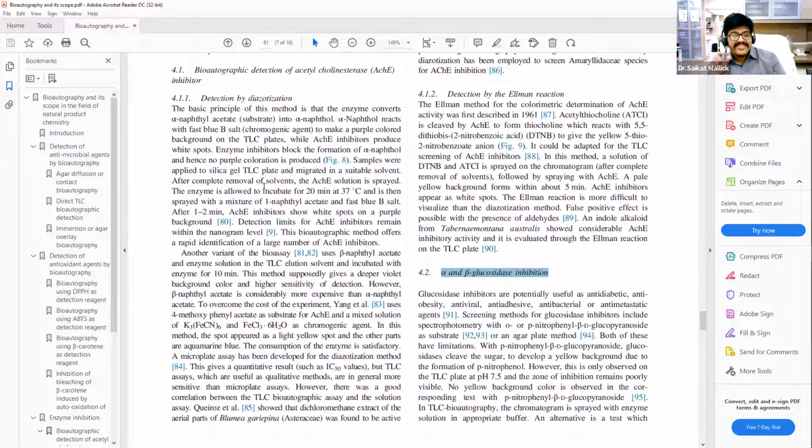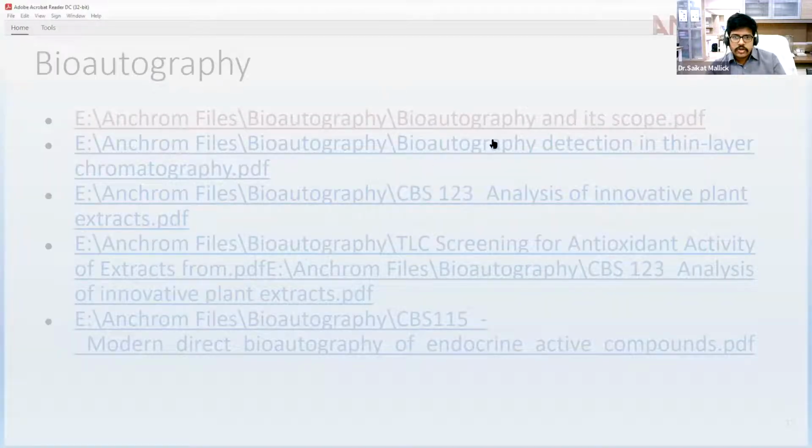What happens is, again, this enzyme is being checked in, that is being cultured into a bacteria and isolated, or directly also. I have not gone into the details, but this is what the enzyme is revolving around. So that enzyme is being used over here, and the inhibition of that enzyme will tell you whether the person will have diabetes or it will be an anti-diabetic by nature. So like that, these are interesting papers. This is one of the papers which I showed you.